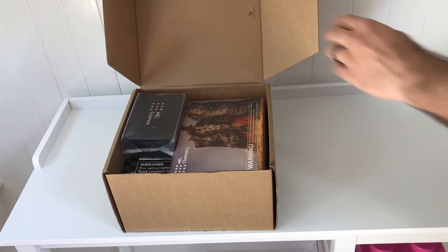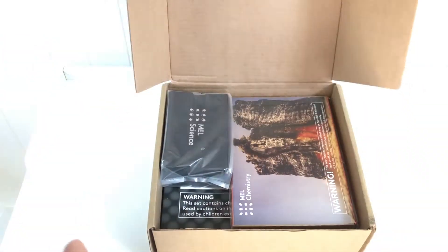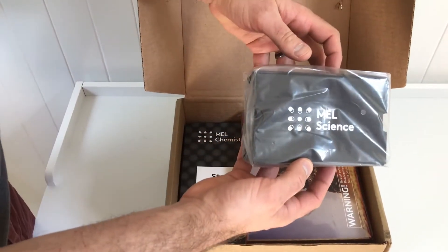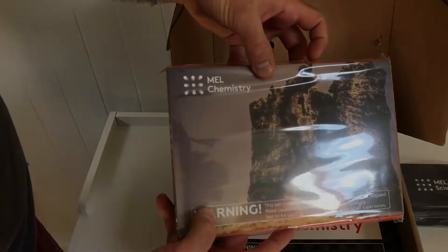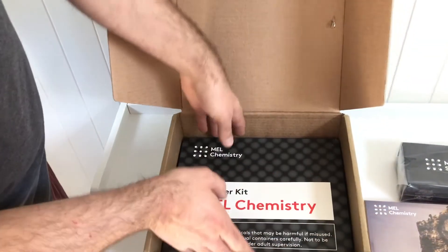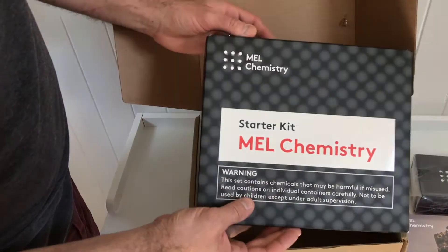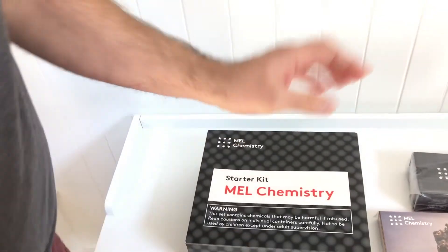There are several components inside this starter kit. We'll take these out so you can get a better view. This is the VR kit — a VR headset that works with Android and iPhone. This is the actual chemistry set with the chemicals we're going to be using in our experiments. And this is the starter kit: when you first sign up, you get it and it includes the materials you'll use throughout your subscription, like beakers and whatnot.